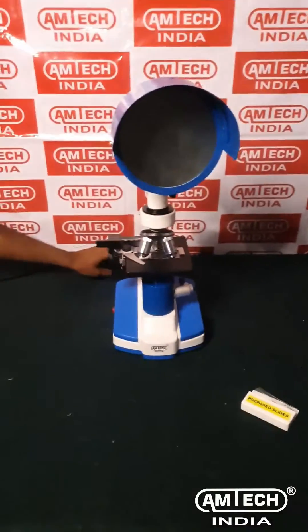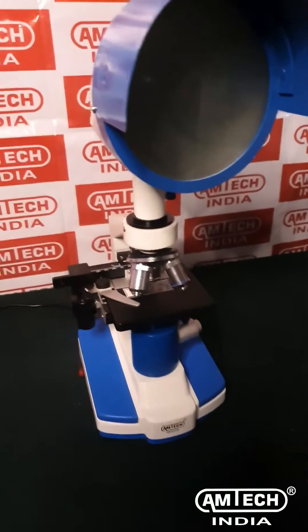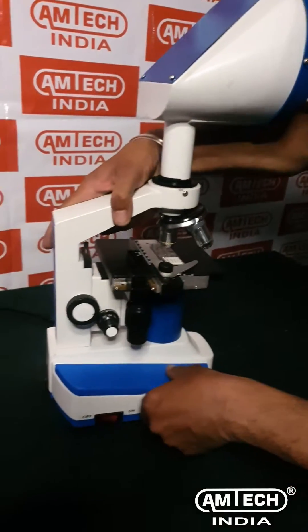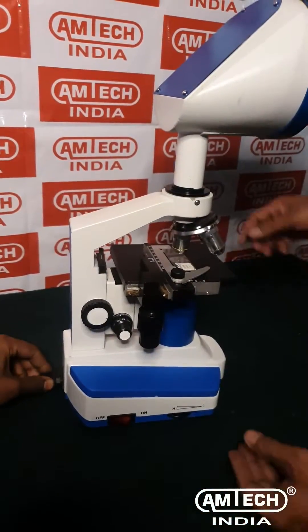Connect the mains cord supplied with the microscope to the input source. The microscope has a power button and light intensity control switch on its one side.